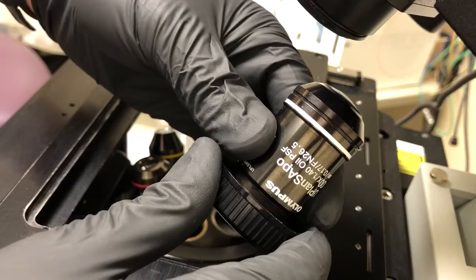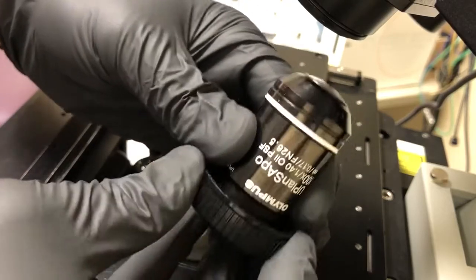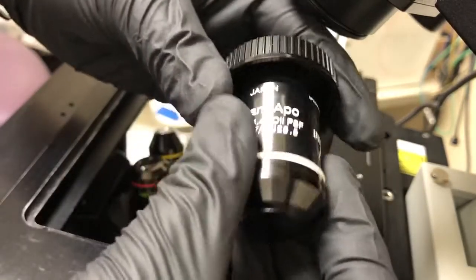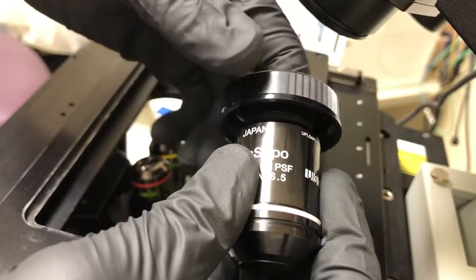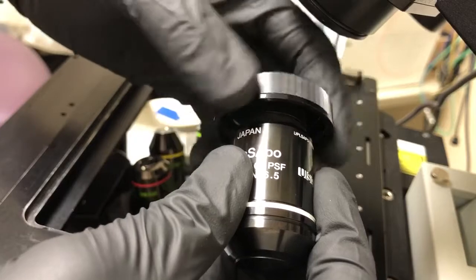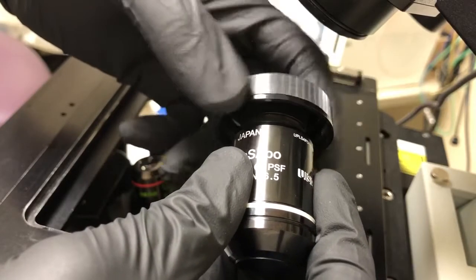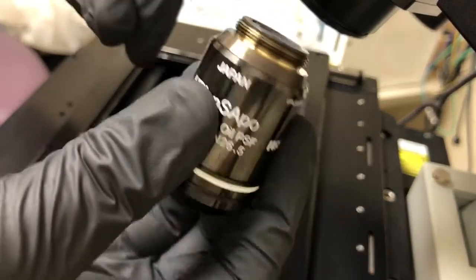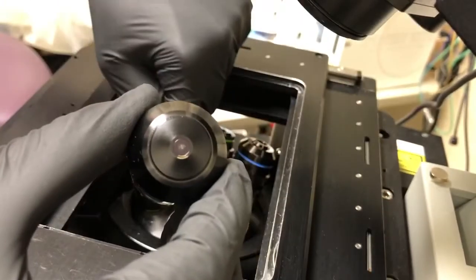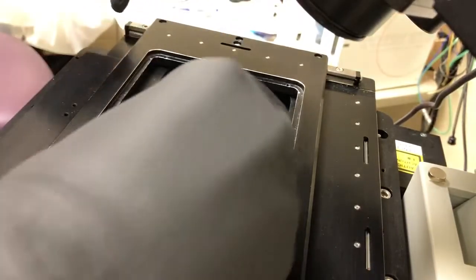Here you can see the objective. I'm going to unscrew it from the base. I like to do that by holding the objective and unscrewing the base, rather than holding the base and unscrewing the objective. So I have a firm grip on the expensive thing, the objective. Now I'll place it in this hole here and screw it in very gently.